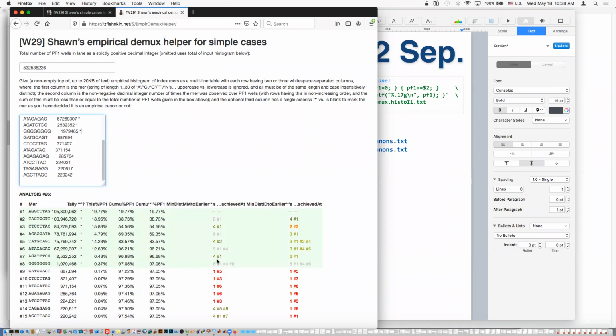You see these are 3, 5, and 4 mismatches away to the previous, so I shouldn't unstar these. They're also not indels, big indels. So these 2 look real here. But what is this? I'll tell you, this is actually the way phi X I2 sequences on NovaSeq version 1.5 chemistry, so this is expected. This is basically the I2 for phi X. This poly G dark for I2 isn't really expected, but it's here. So this is something dark in I2. We don't know. That's kind of unexpected.